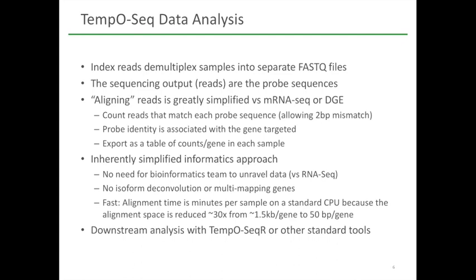This is a very fast analysis. It takes a matter of minutes to be performed on a standard CPU. It does not require complicated statistical deconvolution to identify isoforms or disambiguate multi-mapping to multiple similar regions in the transcriptome.